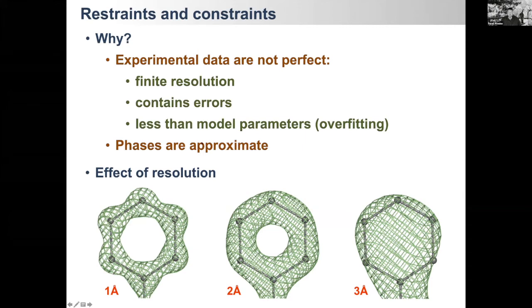Now the phases can come from molecular replacement, or they can come from the experiment and from your preliminary model, and therefore they always have errors, right? And if you remember that formula that I showed you a few slides ago, you use experimental structure factor magnitudes F obs and phases to calculate a map. So all these errors do contribute to how your map looks, right?